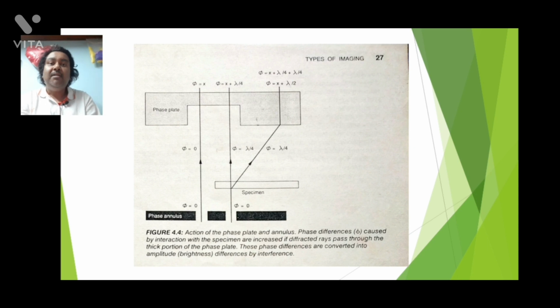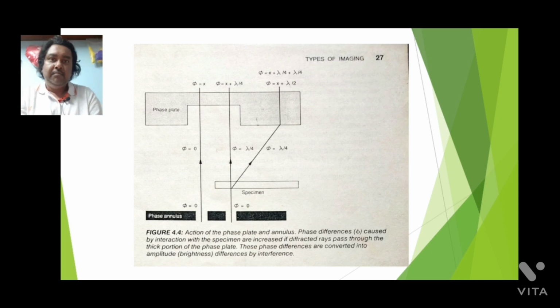Staining is not needed here because before staining, cell fixation is needed, and fixation can be done either by heat fixing or by chemical fixing. Both are hazardous to the cell, and this type of fixing results in cell death, and the stain, which is a hazardous chemical, may also alter the shape of the cell.